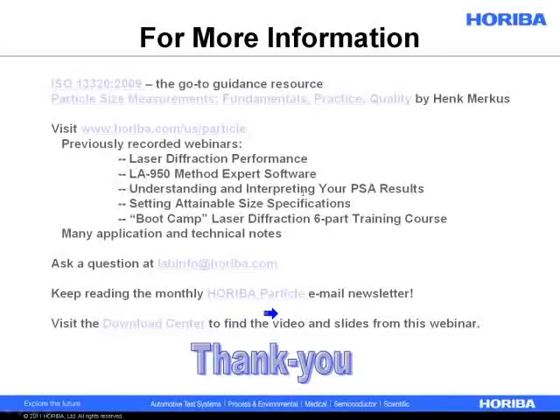Depending on the scattering efficiency, and depending on the narrowness of the actual particle size distribution, if it's very narrow, the instrument can do a better job at picking out the individual peaks. But this again is where diffraction is resolution limited. If the peaks are too close to each other, it's very hard to resolve. But certainly if nano-sized and micron-sized particles are present simultaneously, the instrument should be able to pick them out.